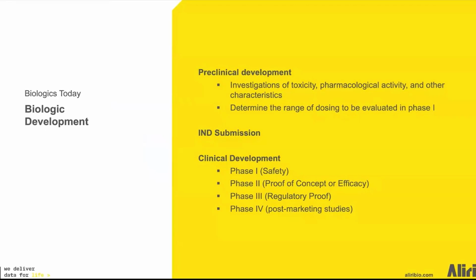For protein-based therapies, traditional LBA assays required the production of high-quality reagents for both capture and detection. The time required to prepare these critical reagents can delay the start of critical decision-making steps. For instance, the time required to prepare antibodies for these assays can exceed 12 months if both capture and detection antibodies are needed. Today, Matt and I would like to discuss the advancements in the analysis of protein-based therapeutics that can shorten the time required to generate IND submission data.